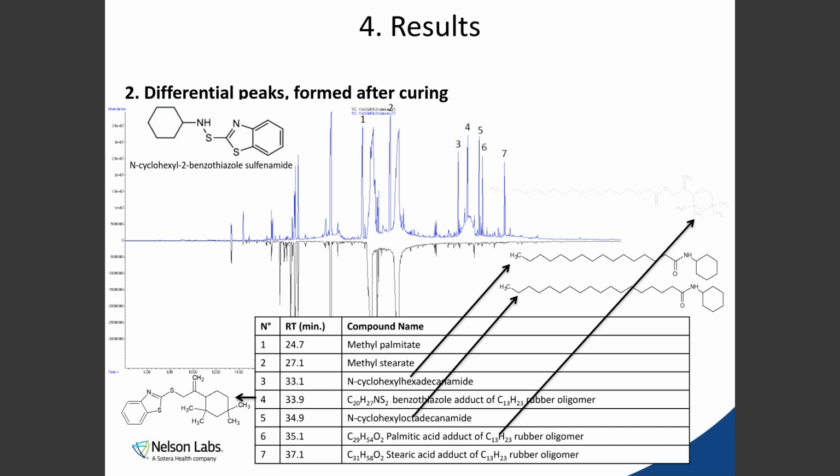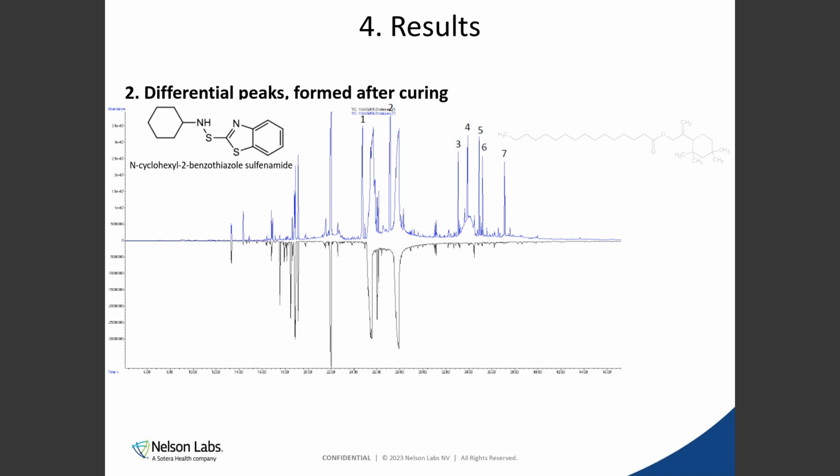And if you see, there are several other compounds that are quite similar to the other reaction, because the mixture is in some part similar to the reaction before. And so that was not really surprising to find them after the reaction. And also those compounds were confirmed by GC-QTOF.